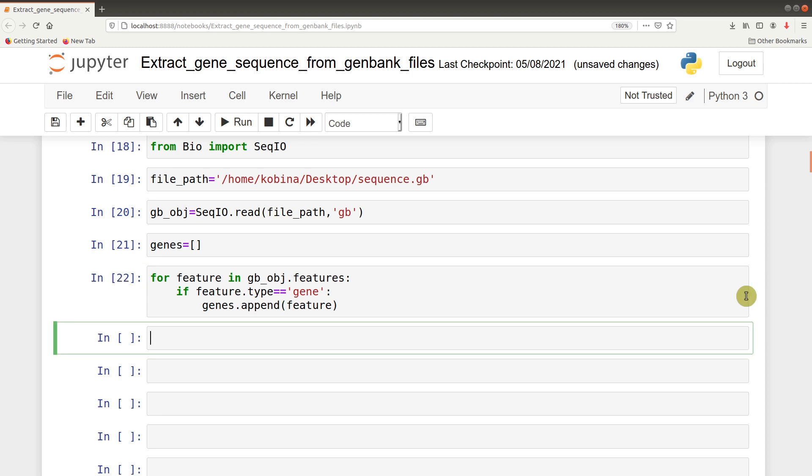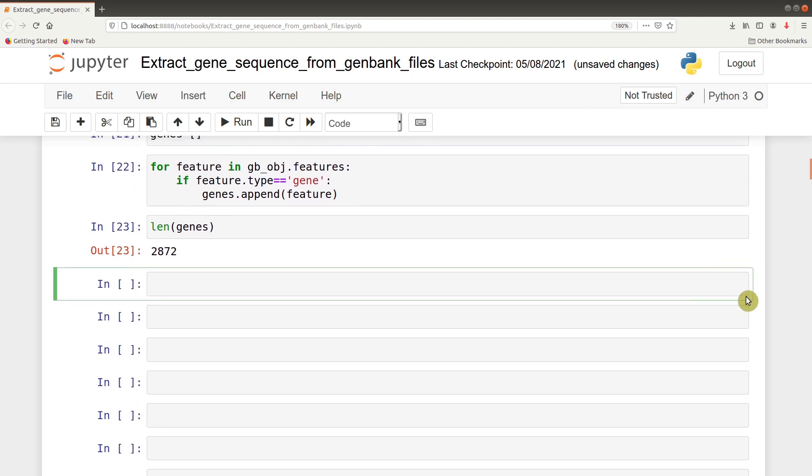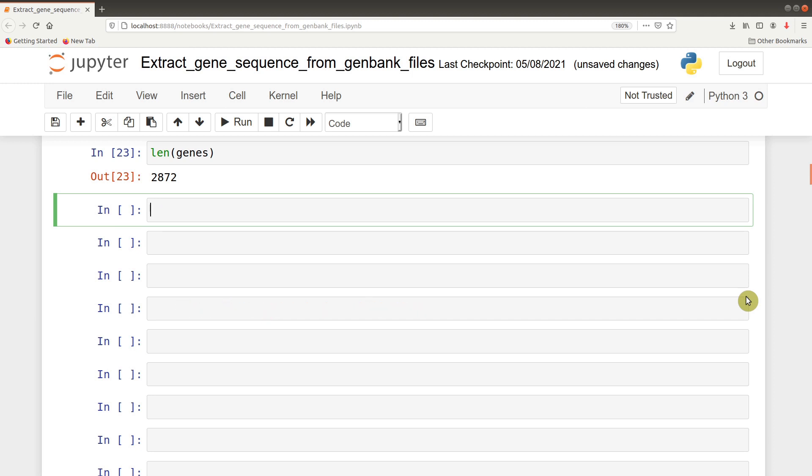After we're done, we can check how many genes were returned by saying len genes. That gives us 2872. But our interest is in a particular gene, which is rpob. We'll now loop through the genes to find the one named rpob. First, we define our gene of interest, which in this case becomes rpob.